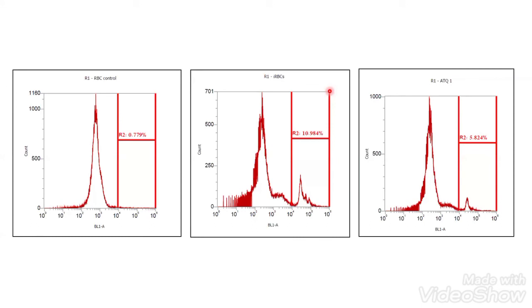So the question is, can we check the effect of substrate prebiotic on mixed microbial culture using flow cytometry? You are trying to say that you have a mixed culture of microbes and you want to characterize them in the mixture, whether a particular proportion or percentage is present or not.